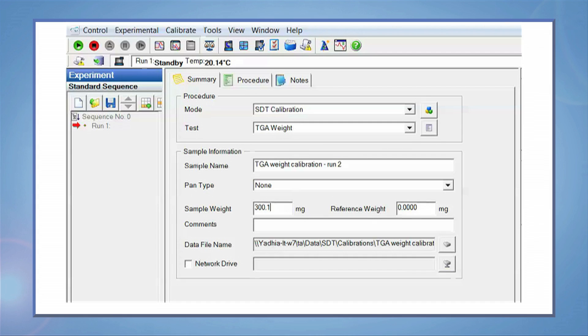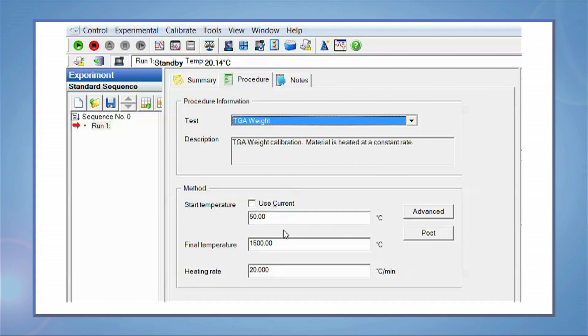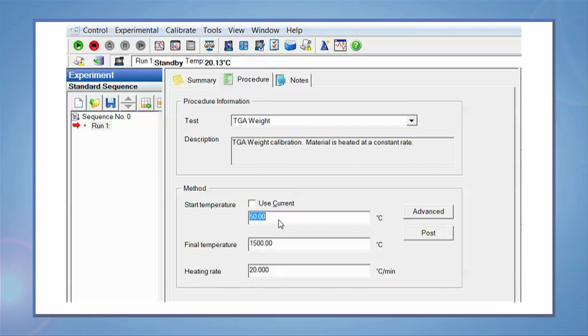Enter the sample information and the data file name. Select the same temperature range and the heating rate as the previous run. Click on play.